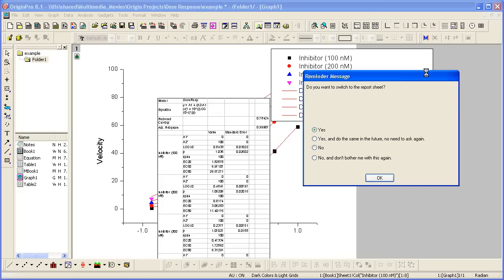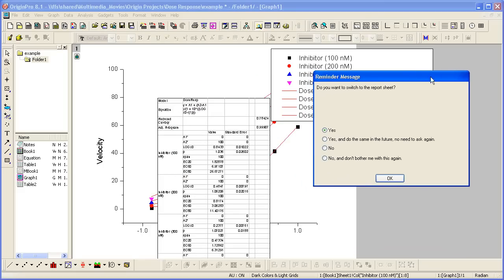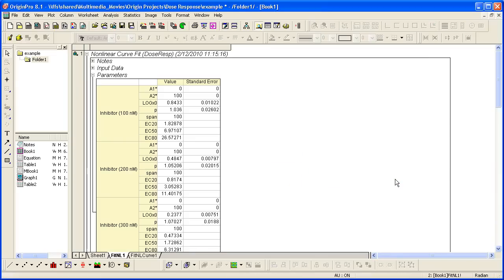Origin will paste the report table on the graph. It will also ask me if I want to switch to the report sheet. Let's go ahead and do that. This was created in the same book as the raw data.